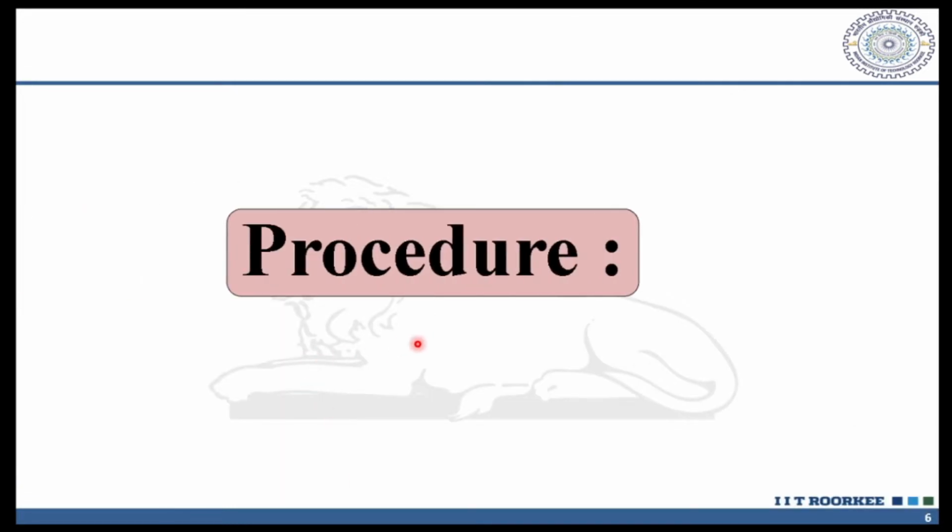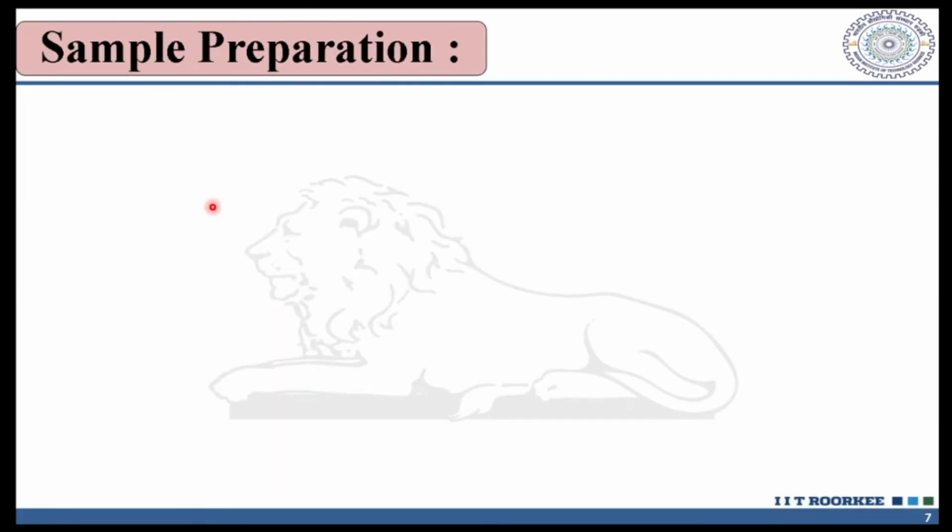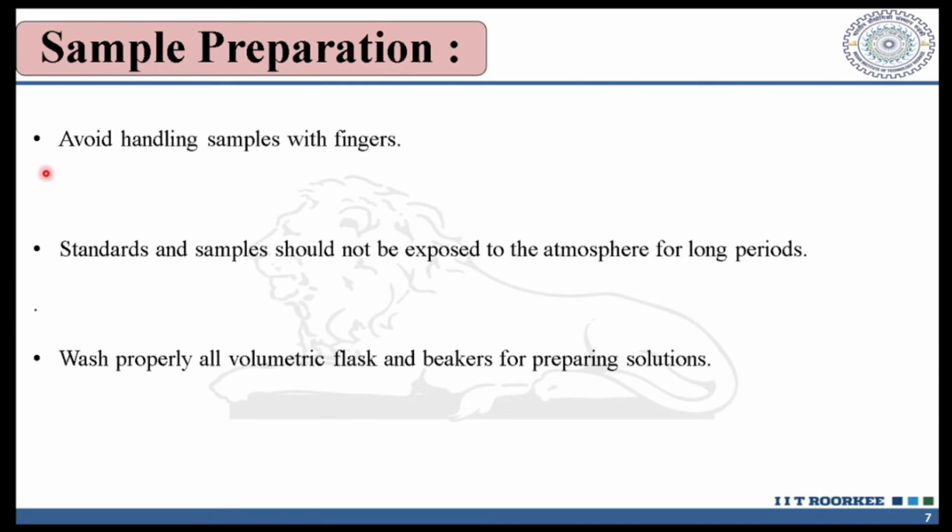Now we move to the procedure. First, we will look at sample preparation. There are some points regarding sample preparation which should be adhered to in order to achieve the required accuracy in your analysis. First is, you should avoid handling samples with fingers. This leads to serious contamination.